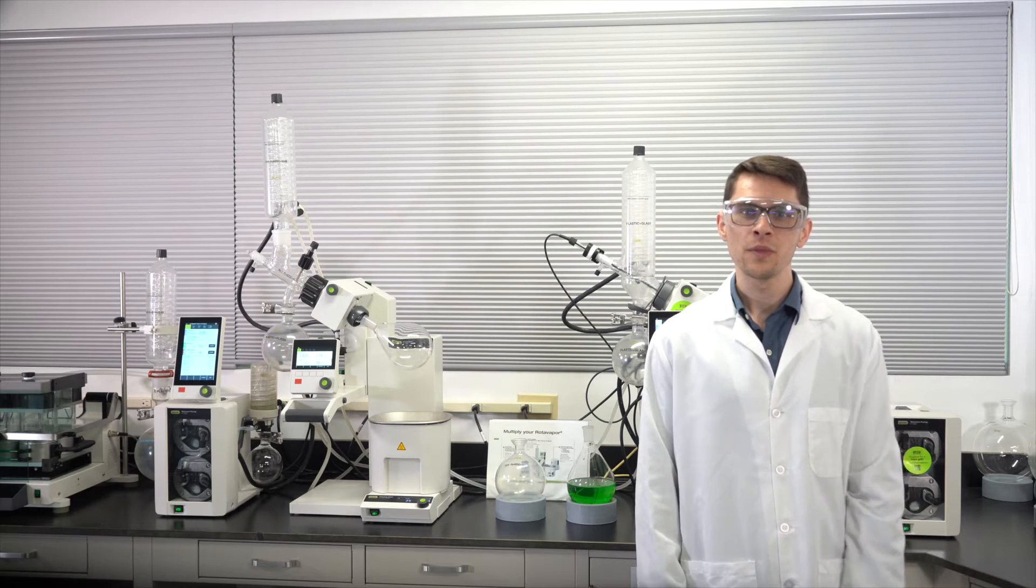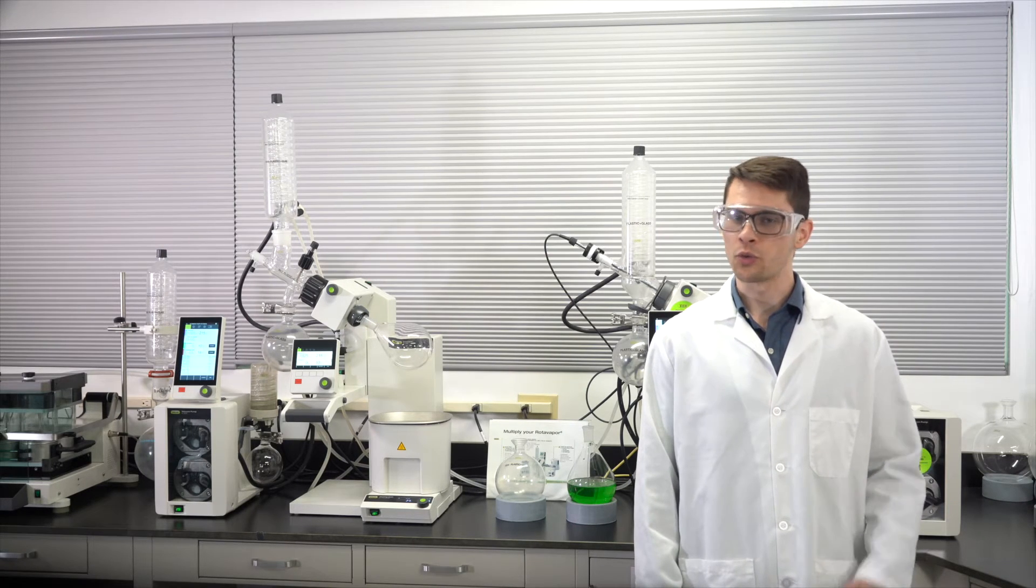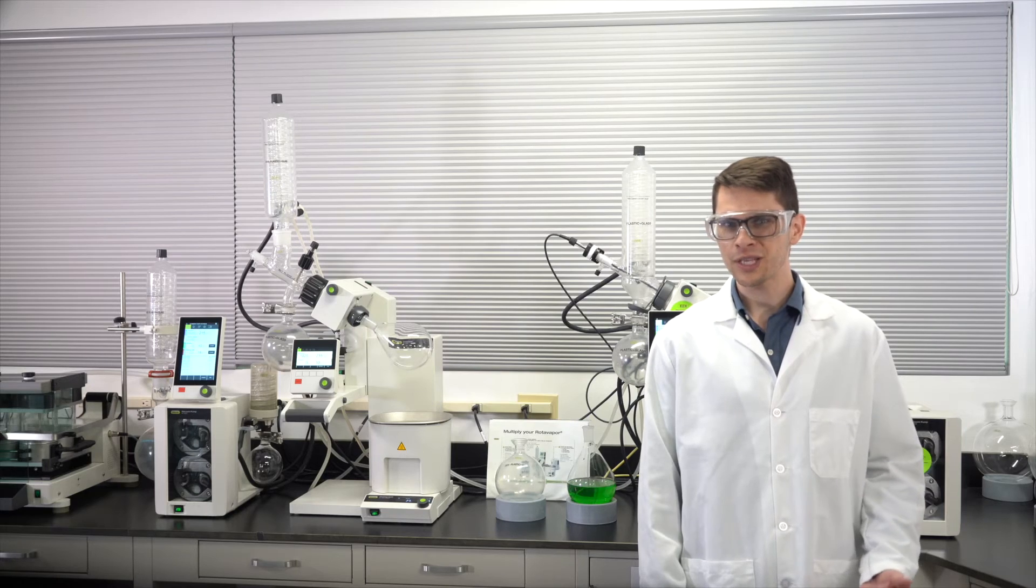I have to go check some emails, but I'll be able to monitor the progress of my distillation directly from my phone. It's almost like being two places at once.